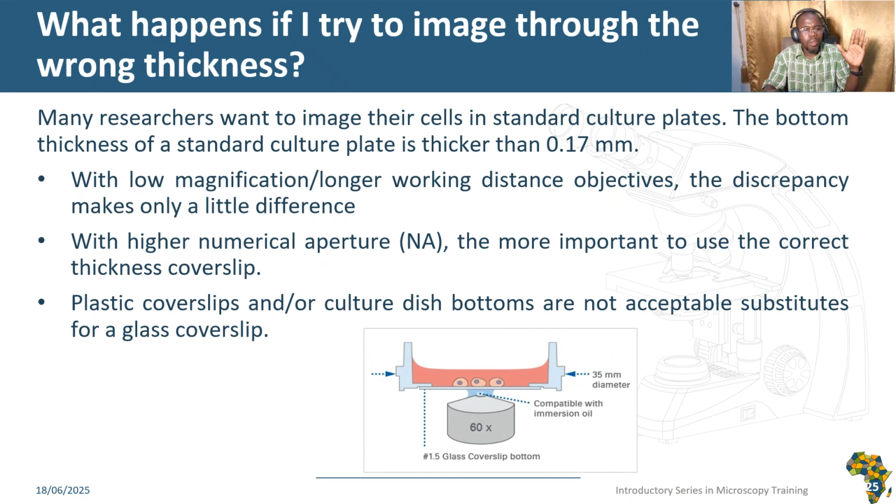And what happens if I try to image through the wrong thickness? Yes, a number of things will happen. Among them, you are going to have a focus problem, poor contrast, and of course, unclear images.